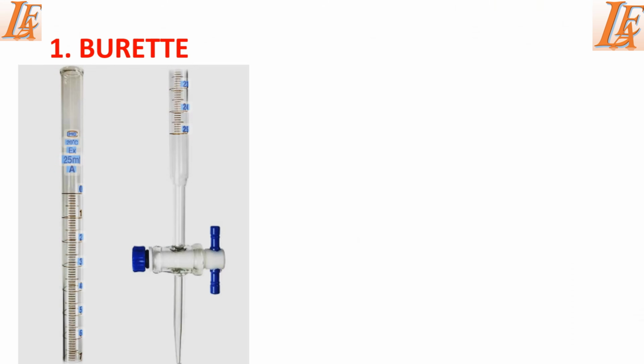So the first instrument that we're going to discuss is a burette. A burette is defined as a long graduated glass tube with a tap at the bottom. In this case, what we have here is what we call a tap, and the function of this tap is to control the amount of liquid flowing out of the burette. Most burettes have a scale ranging from 0 to 50 cubic centimeters, but sometimes we can have burettes with a scale ranging from 0 to 25 cubic centimeters, like the one that we have here on the screen.